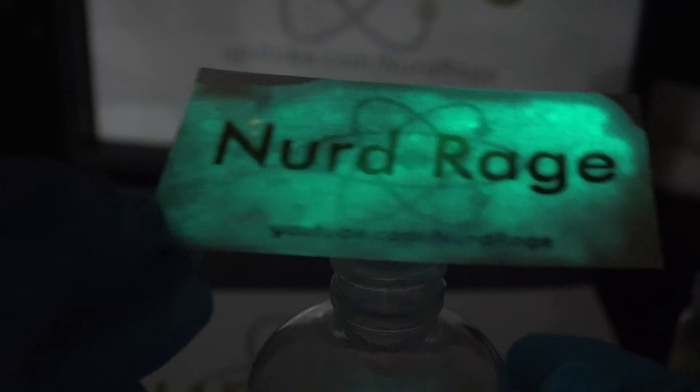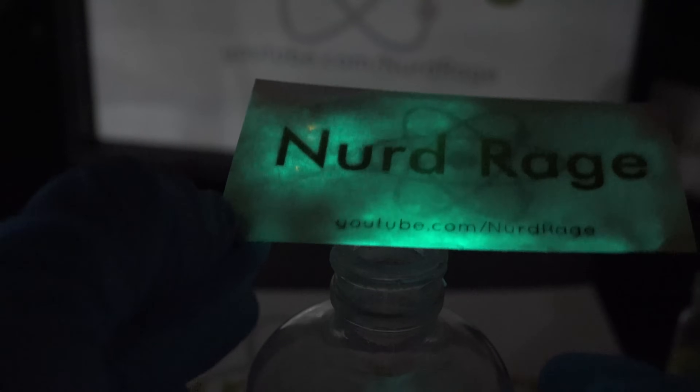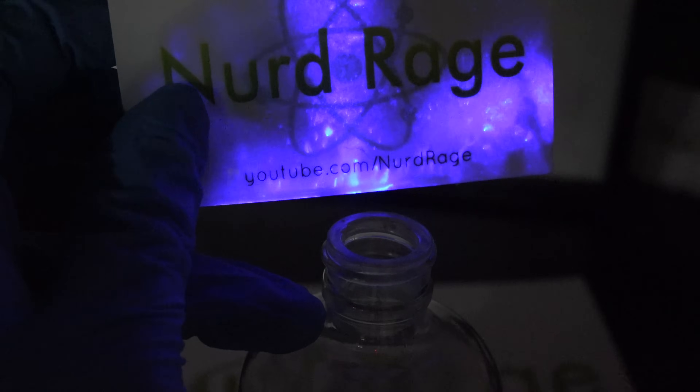Oh cool — the solution actually soaked all the way through the card, so it even works through the back. Now I'm going to do another dye: 9,10-diphenylanthracene. Simply sublime.